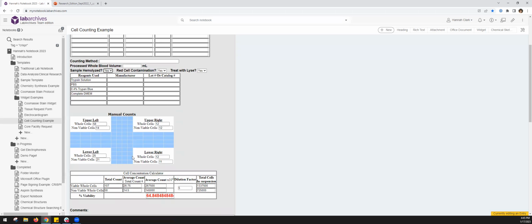Now, this is the kind of math I could do on the scribble on the side sheet of paper or in my head if I really want to. But by having it done for me, so I can just type in the numbers as I see fit and keep working as I go, it does the math for me and reduces the number of napkin math mistakes I might make.